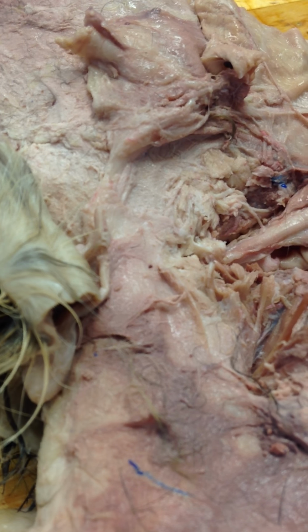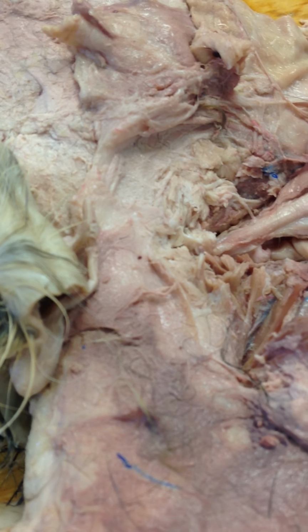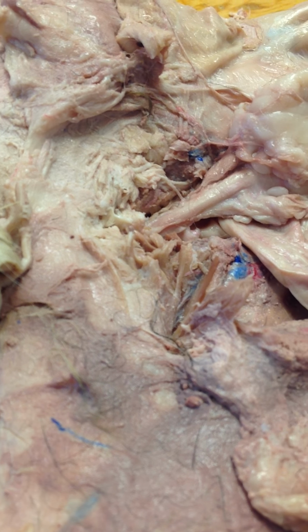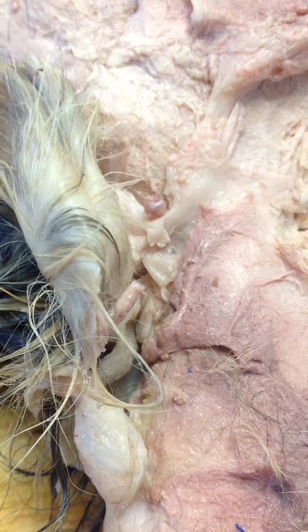Did you guys find the prostate? No. Yep, so the spongy urethra is through there. It's towards the end of the penis, not quite the end, right before it. It's a bit of a mess.